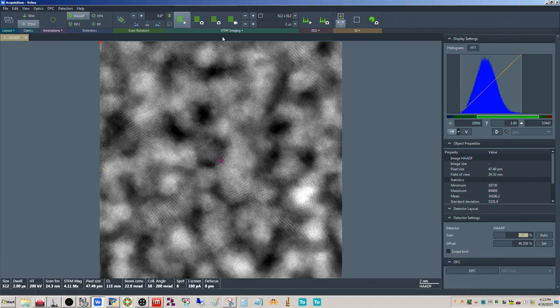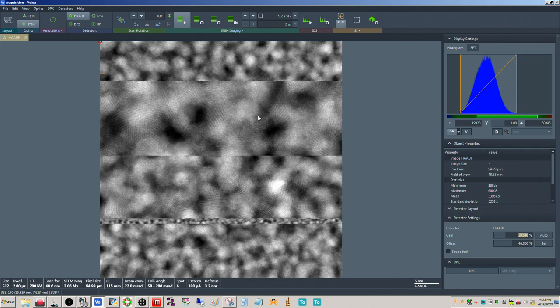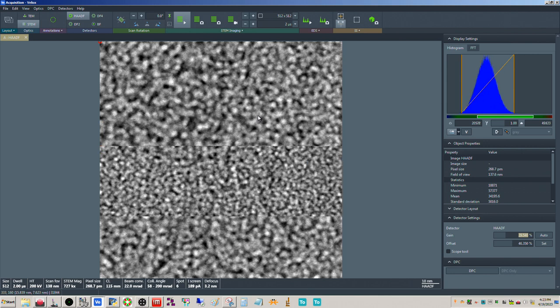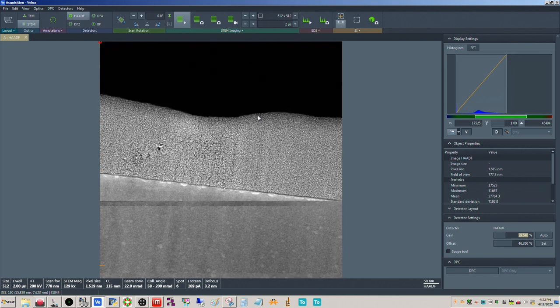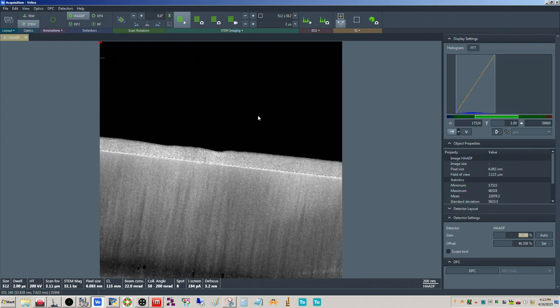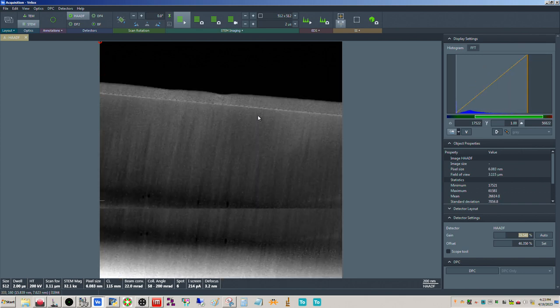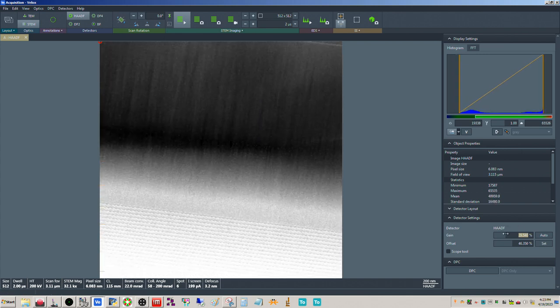All right, let's take a look. Perfect. Okay. Wonderful. All right. Just like that, STEM alignment is basically done. All right. So the crystallographic directions here, and you can see the quantum well structure now here a lot better.